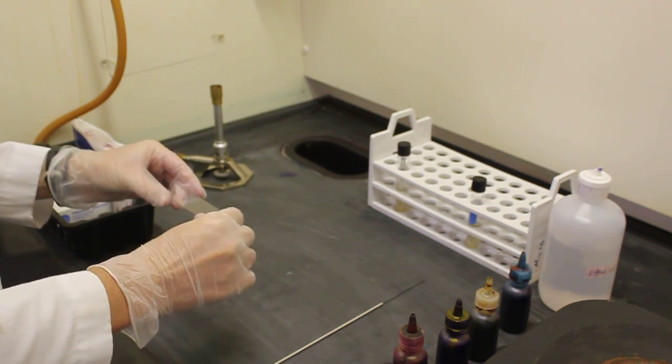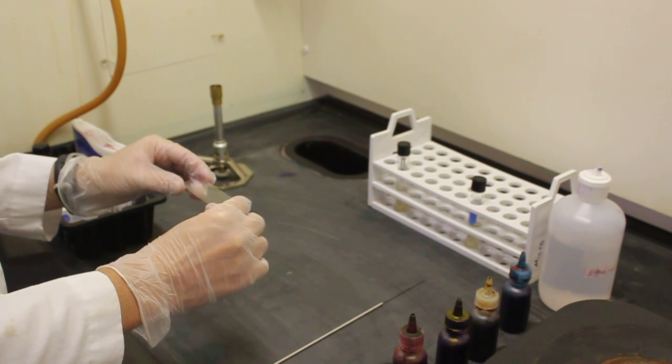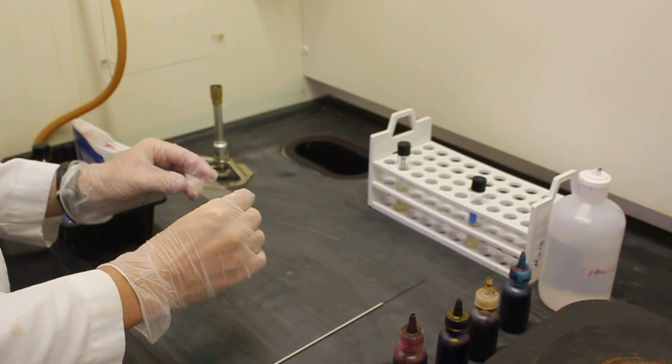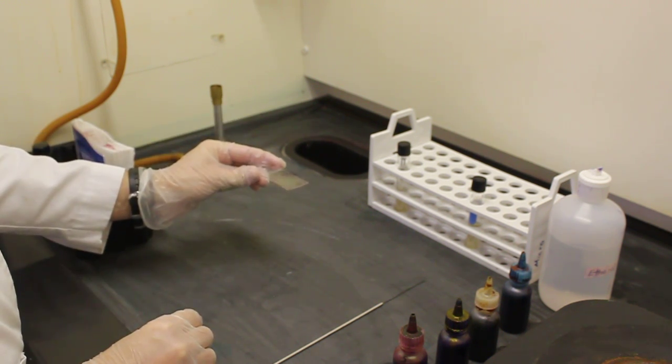To complete a gram stain you must have previously made a smear on your microscope slide and heat fixed your sample. This slide I am demonstrating with is a heat fixed sample of bacteria.